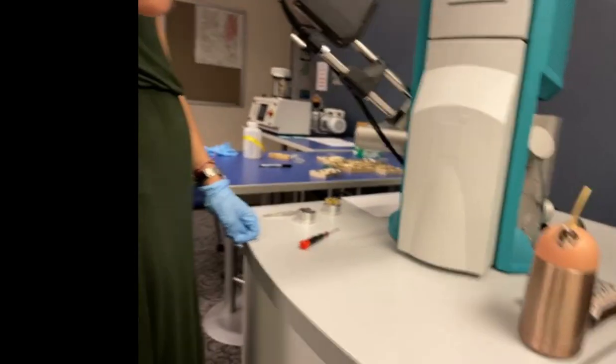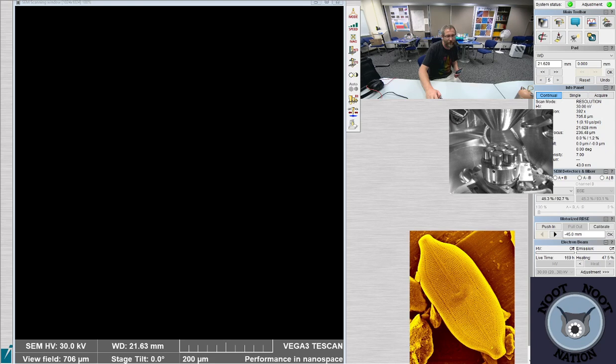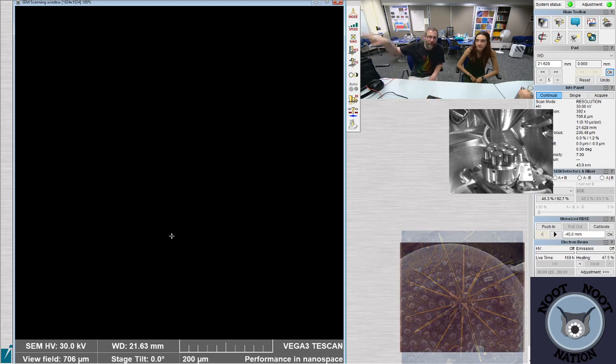Is the gas on? Yeah. Okay. This chamber's open, so we can switch over to the main view, and I can put my droid cam away. I don't think we need to watch me. Change the dehumidifier. Hey, Anna, how are you doing? Yeah, we're looking on the inside of the SEM for a minute, and now what we have to do is pump down the SEM. So there's the normal noise that you hear, which is the pump engaging and trying to pump all of the humid air out of the chamber.